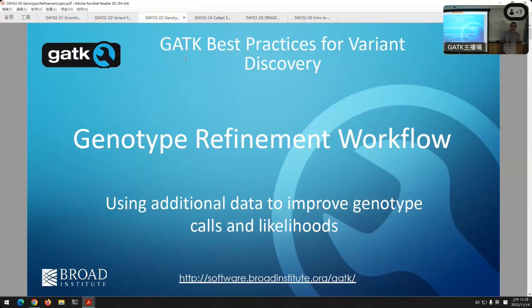Actually, there is a sense kind of where it could make sense biologically, which is tricky. And that is when you got the genotype wrong in the parents. For example, let's say the mother was not actually homozygous reference, but the mother had a large deletion. And so actually she was heterozygous reference and a deletion. And what she passed on was the deletion to the child, and then the child could have gotten the SNP from the father. Now the child has a deletion and the SNP, and it looks homozygous. So that's a rare case.